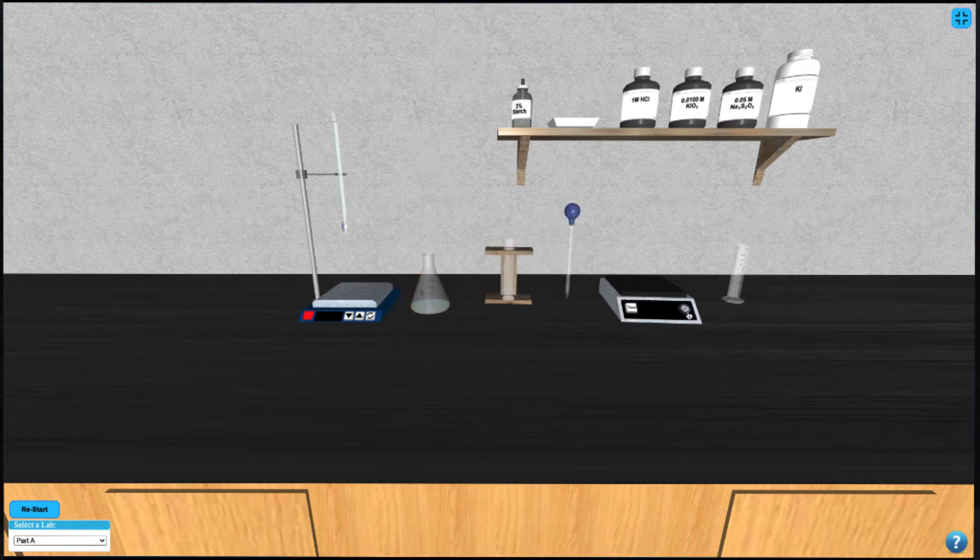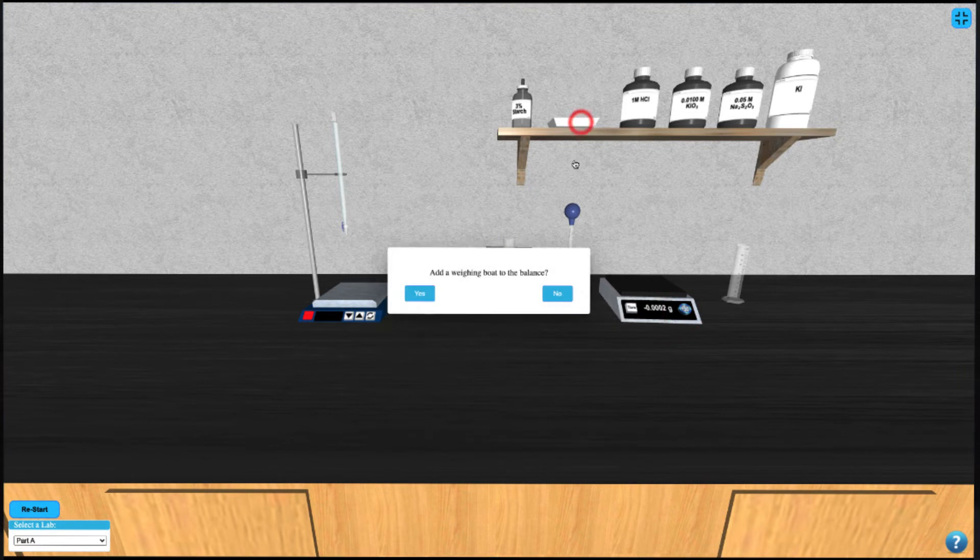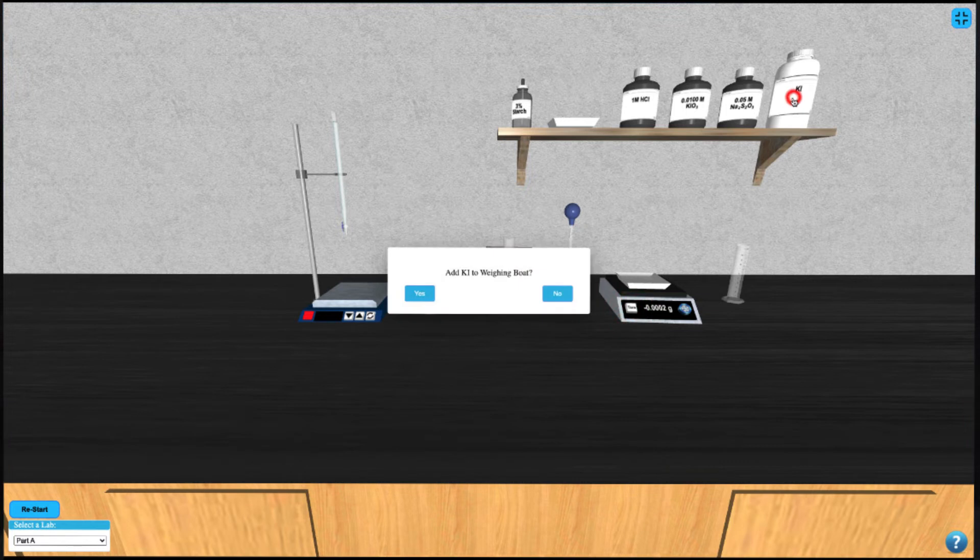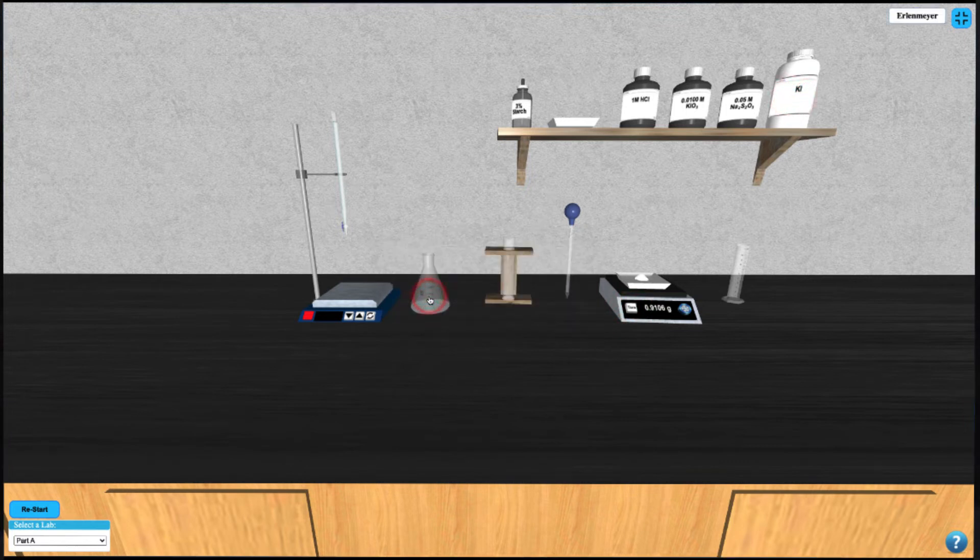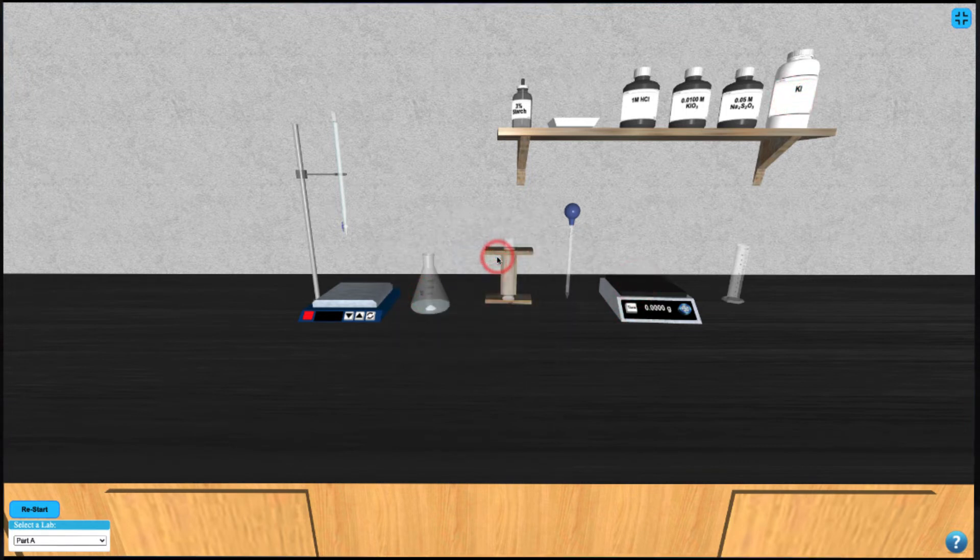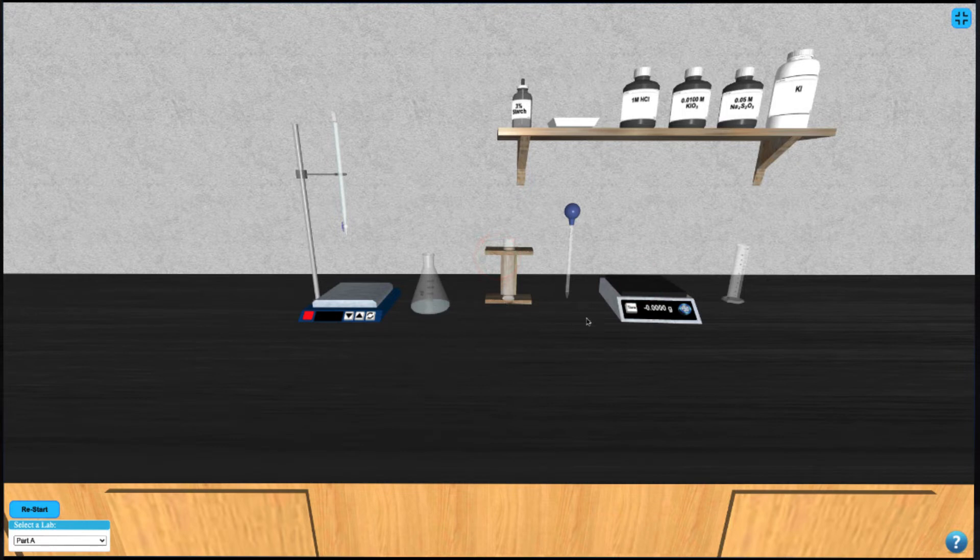We then turn on the balance and add a weighing boat to it and tare the mass of the weighing boat. Clicking on the potassium iodide bottle will dispense the KI sample to the weighing boat and you can take note of the mass you have. Then you can add it to the Erlenmeyer by clicking on it.